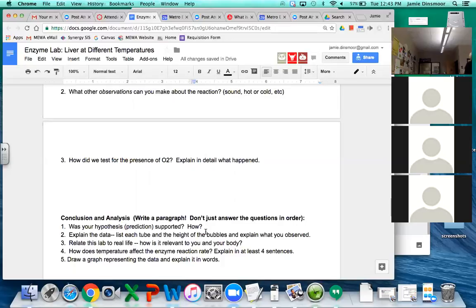So we'll get a big piece of liver for this. We can keep using liver too. I will say I have about an 80% success rate on this. So it usually works, but there's been a couple times where it's not worked as well as I would like. And I'm not really using a stick, so I'm also a little scared about burning myself, but that's okay.